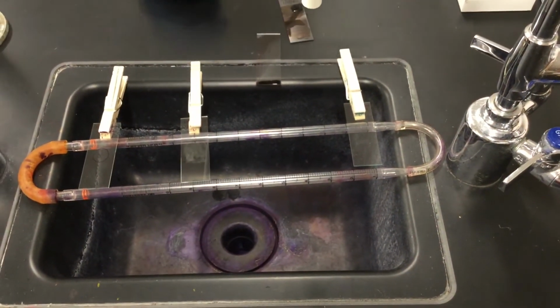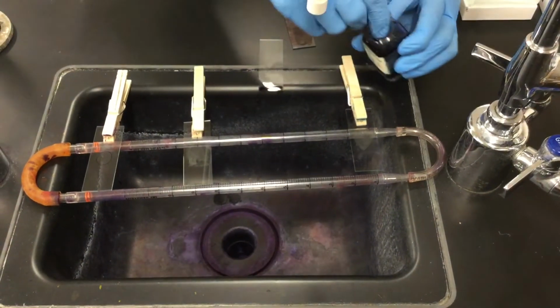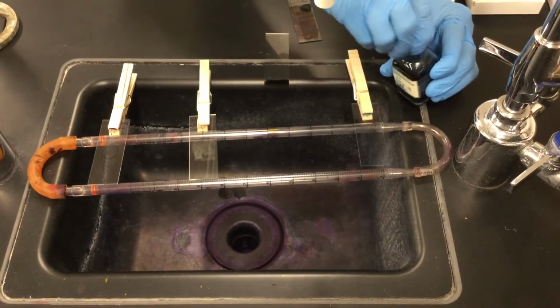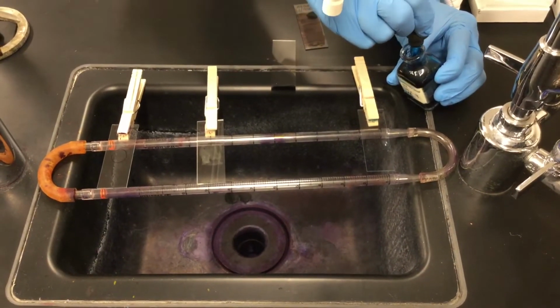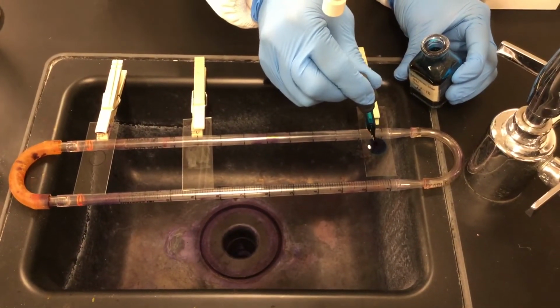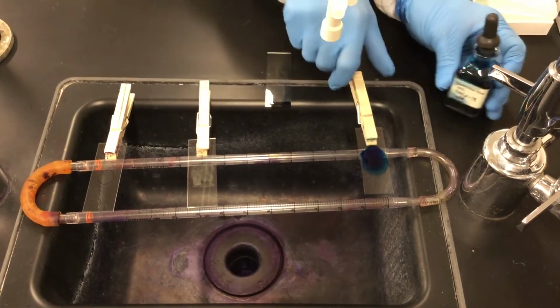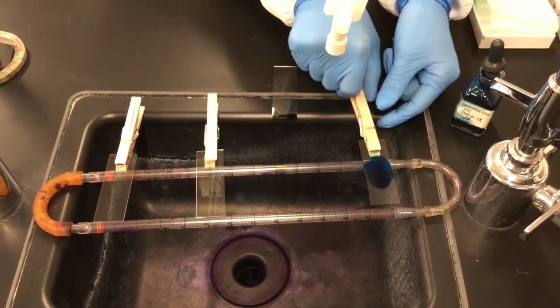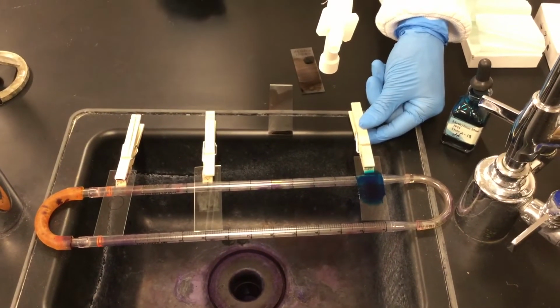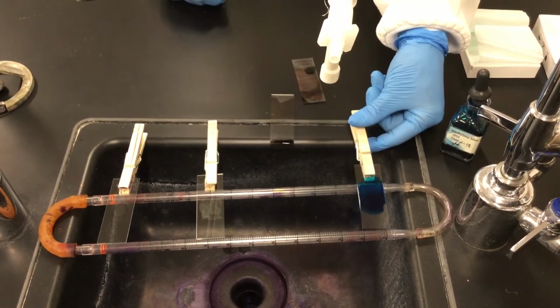So I'm going to add, in the area where I had this smear, the methylene blue. Like 5 to 6 drops, and then count the time for 1 minute. And there's a clock there in the back of the room that I'm going to be using.